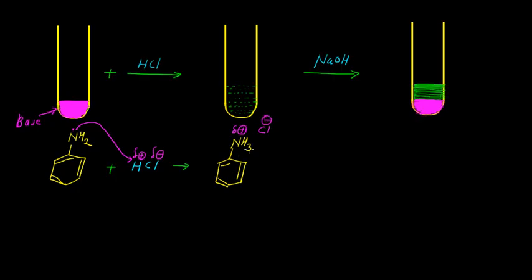Such type of intermediate is generally known as anilinium chloride.